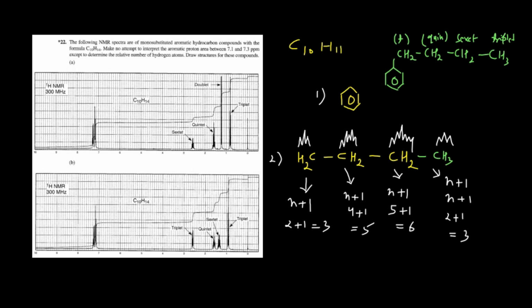And what information can we get from the chemical shift values? You can see the most downfield signal is at 7.1 ppm. Obviously, this is due to the presence of these hydrogens which are connected to the benzene ring. The second one is the triplet. Now you have to decide, you have 2 triplets. One triplet is this one, another triplet is this one. Since you have the 2 triplets, now it is your duty to decide which triplet this chemical shift belongs to.